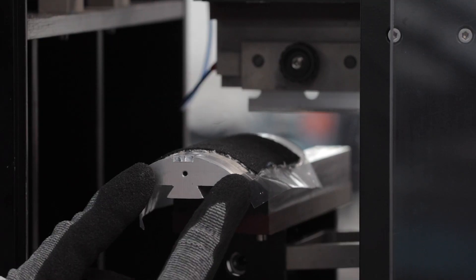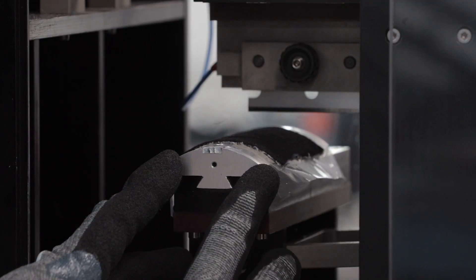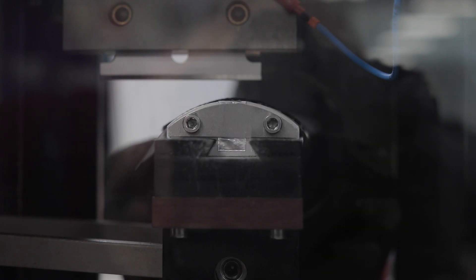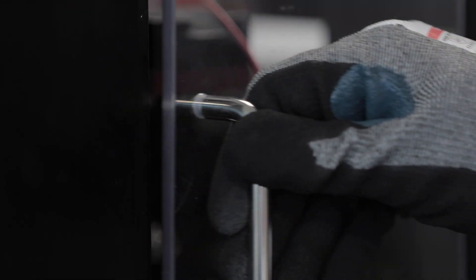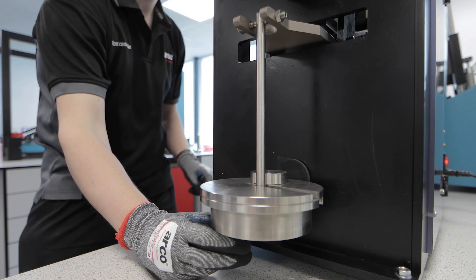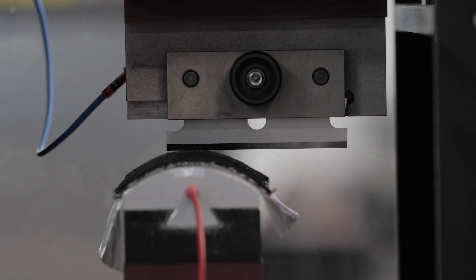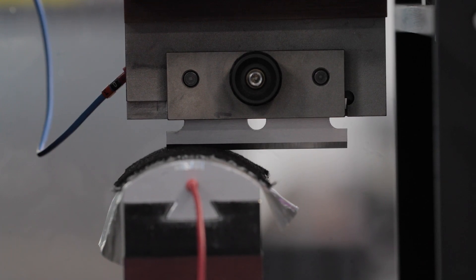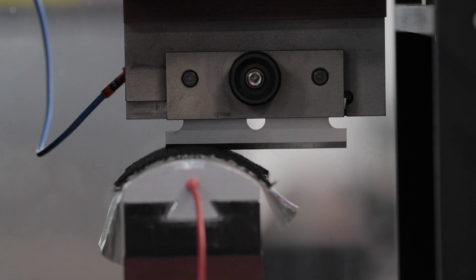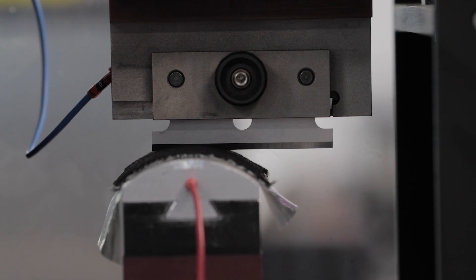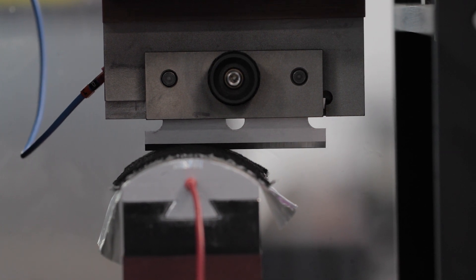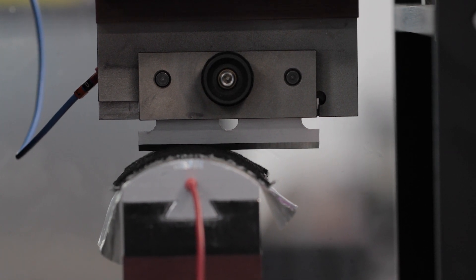The plastic film prevents false positive results when the glove material includes metallic yarns. Once raised into place, the cut resistance evaluator drives a straight-edged blade across the glove sample until it cuts through.